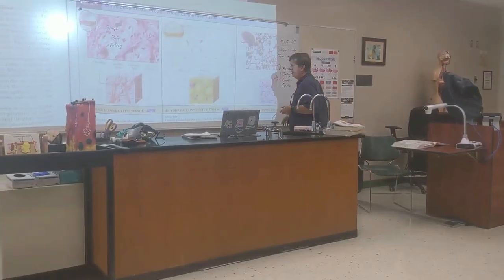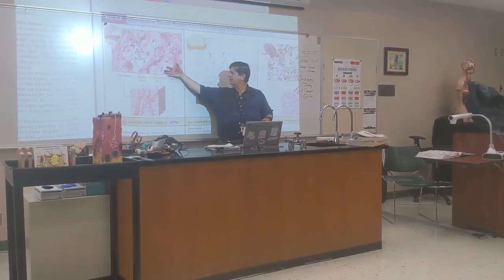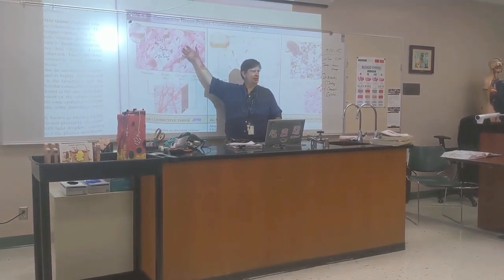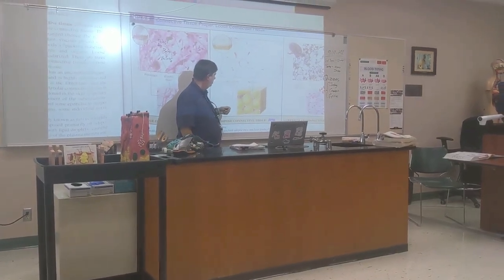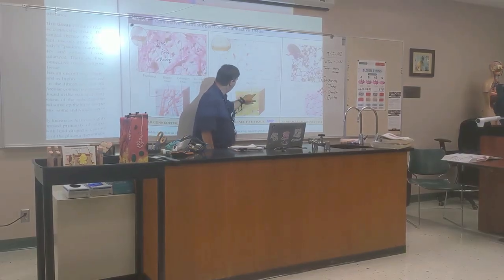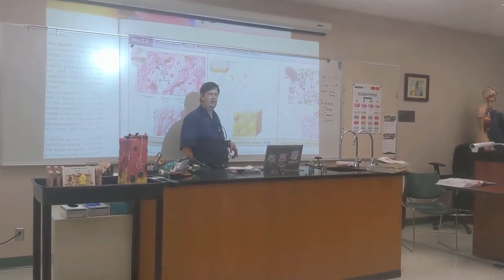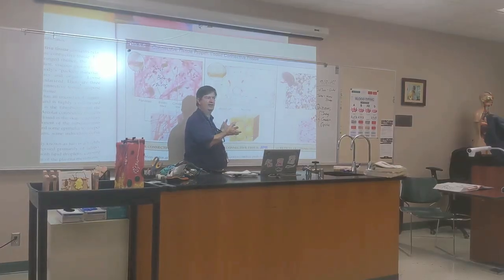But what I'm getting at is these are all three connective tissues. And you can see when you're looking at the areolar, a lot of space and a lot of fibers. Are you with me? You have cells, but they're not the main thing. Now you look at the adipose tissue, and you've got all three things, because you always do. But it's mostly cells. There is space, but there's not much ground substance, and you'll be really hard pressed to find the fibers. You have to look a long time on a slide to come across a fiber, because there's not much room. Does that make sense? Everybody see it?